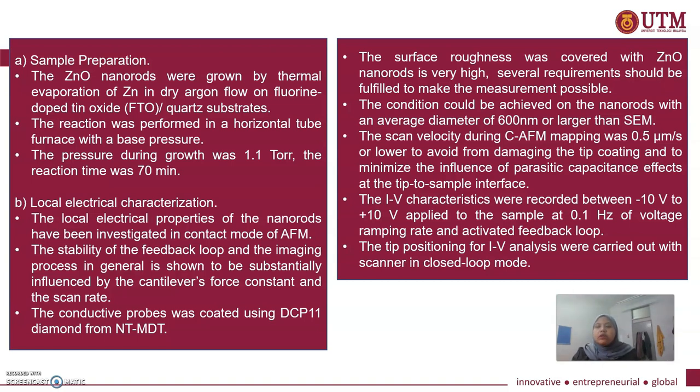The scan velocity during CAFM mapping was 0.5 micrometer per second or lower, to avoid damaging the tip coating and to minimize the influence of parasitic capacitance effects at the tip to sample interface.